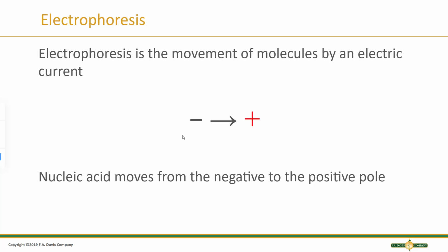Nucleic acids have an overall negative charge, so when we load nucleic acids on the negative side, they are repelled from like charges and migrate toward opposite charges, because opposite charges attract. So if we have negatively charged DNA and we load it near the negatively charged electrode, it's going to naturally want to migrate through the gel toward the positive charge.